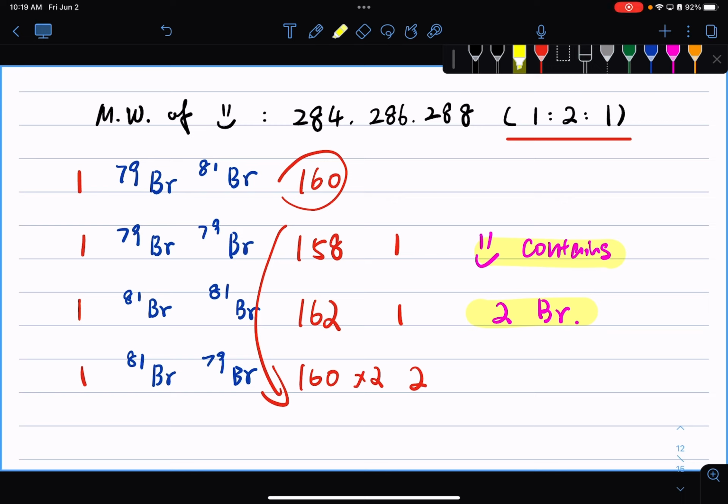Now we see there is a base peak at 126. So what does a base peak in your mass spectrometry tell you? The base peak in your mass spectrum tells you how your molecule breaks down into fragments. So that base peak is hinting, hey, we're forming some kind of stable cationic fragment that has a molecular weight of precisely 126.